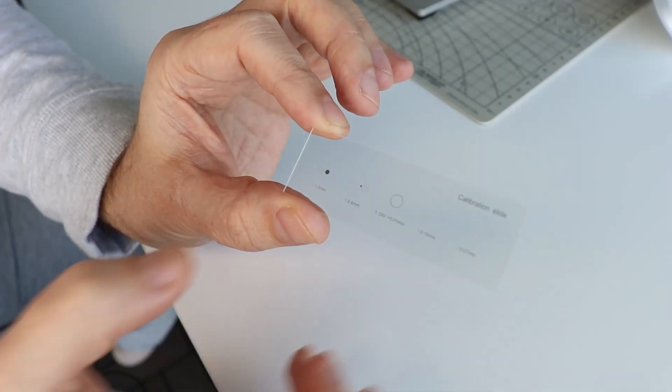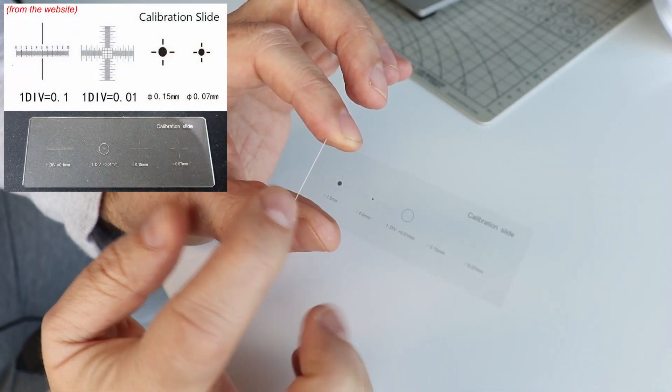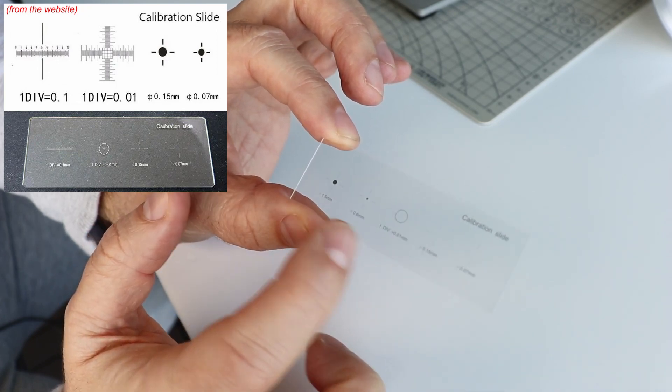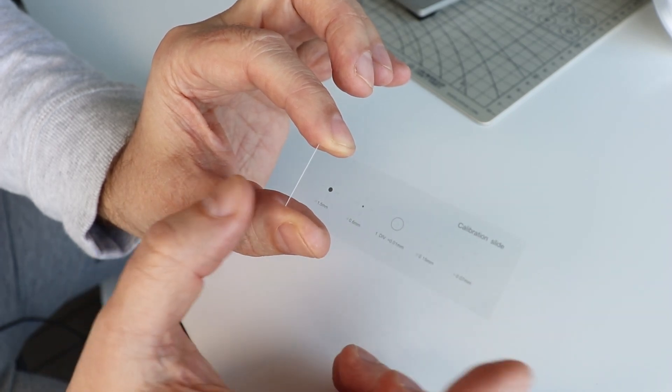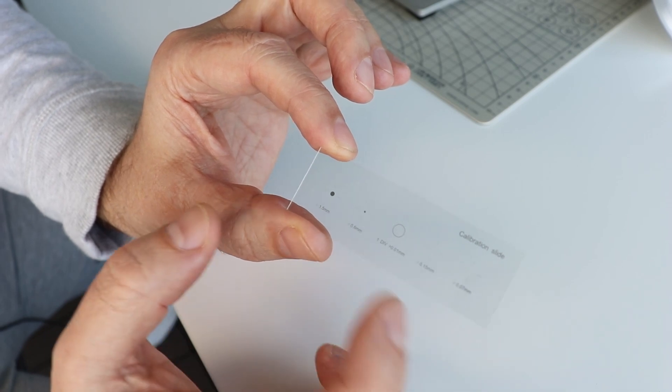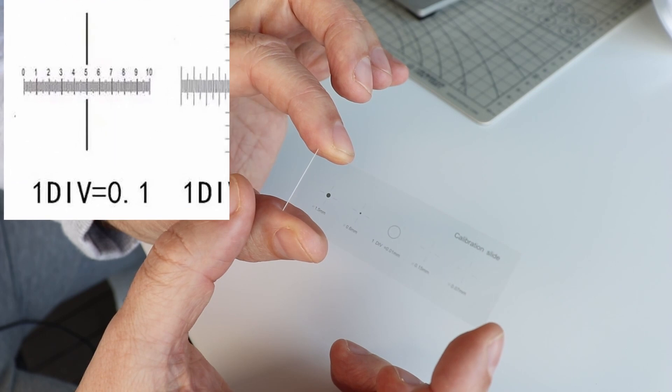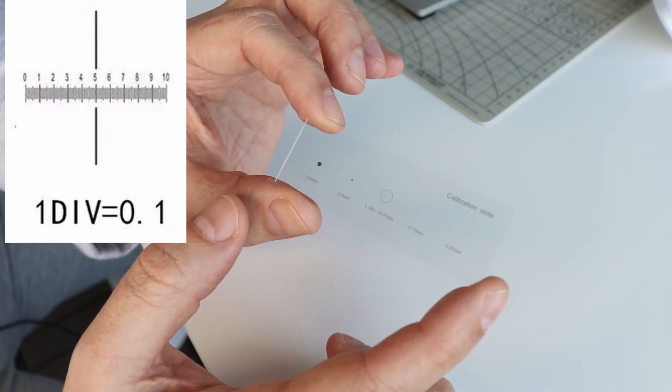Now here it is not exactly the object which I saw on the website. What I have here are four calibration points: 1.5, 0.6, 0.15 and 0.07 millimeters. And then in the middle I have a ruler of division of 0.01 millimeters. What I am missing here a lot is the ruler of the division of 0.1 millimeters because I think for my needs that would be the most useful.